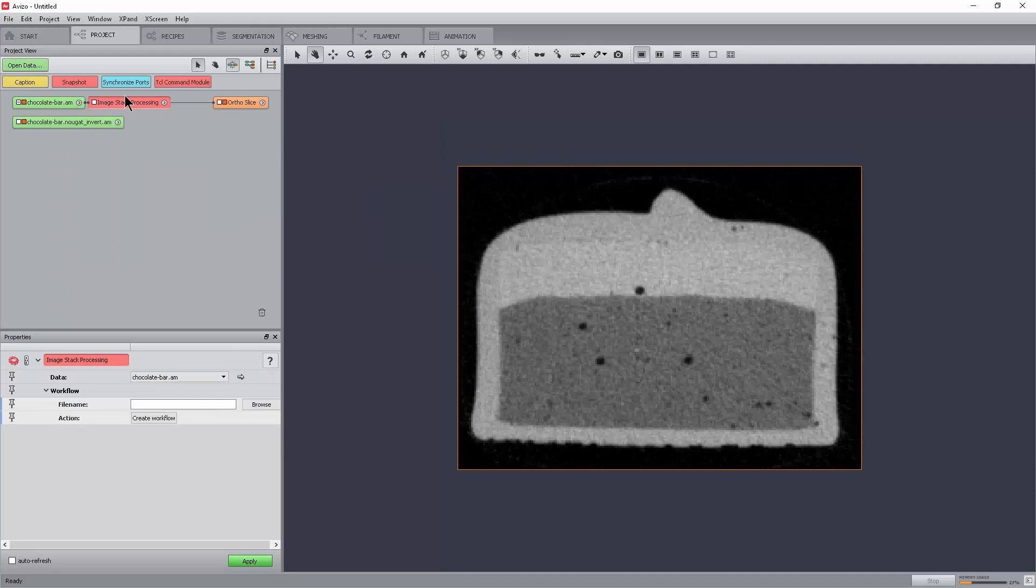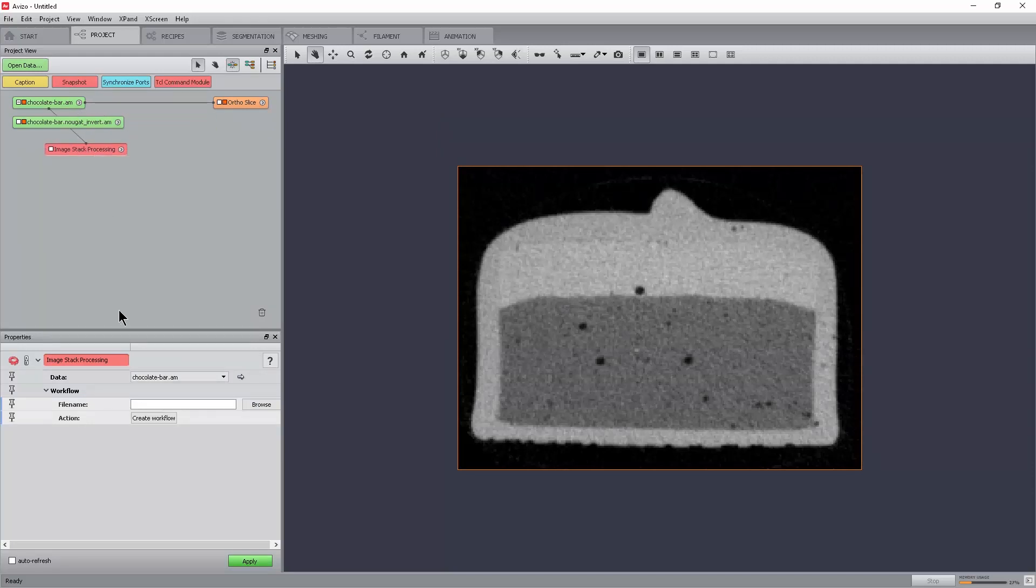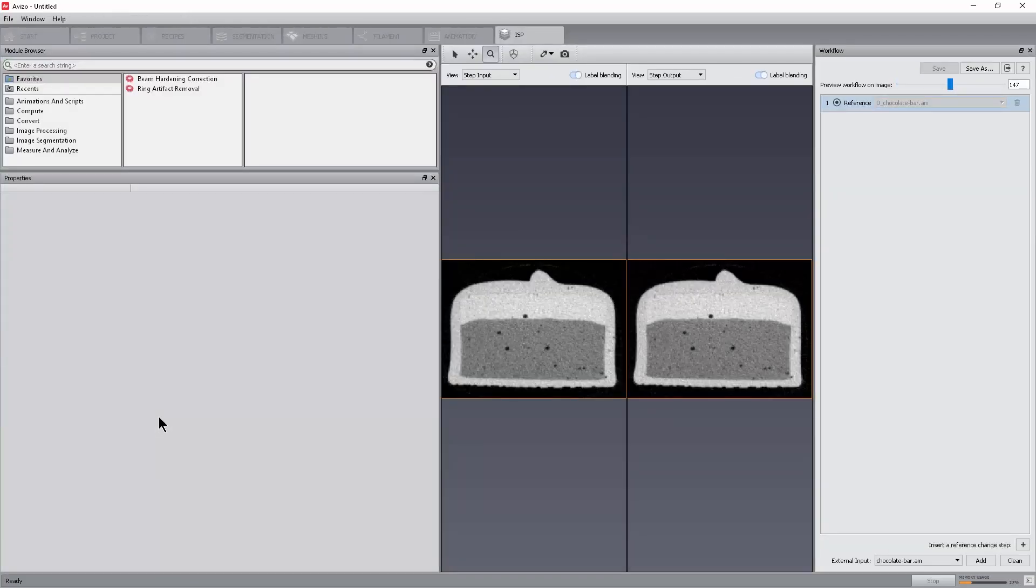Select the module and in the Properties panel, click Create Workflow of the action port. The Image Stack Processing Workroom opens with the reference data being displayed on the left and right viewers.